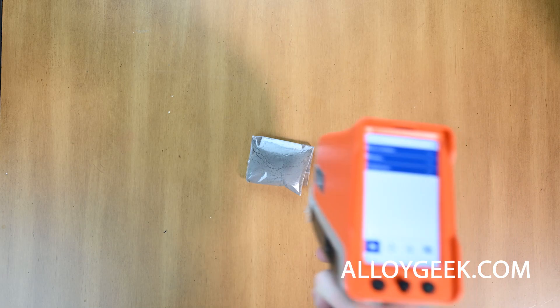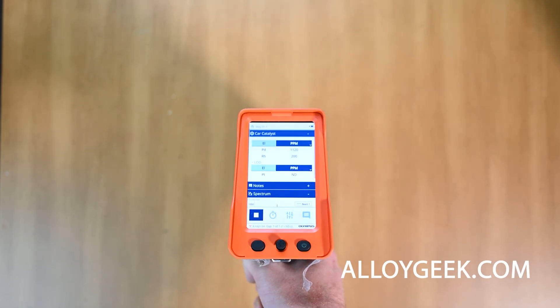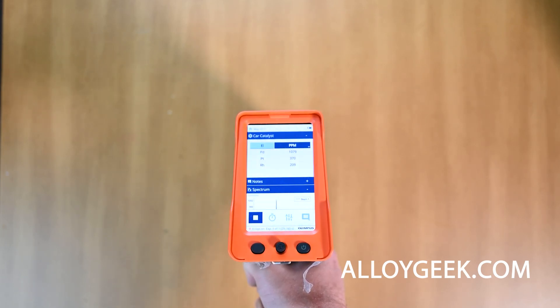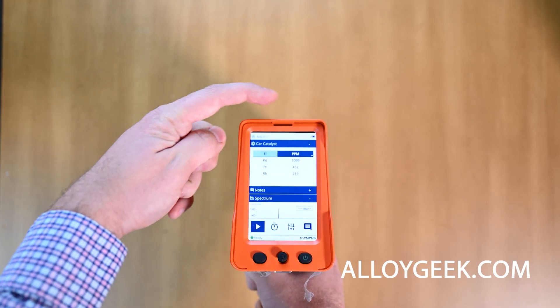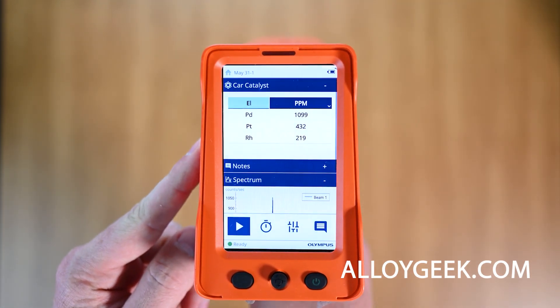Now we can begin the test. I've sped up this test because each test should take at least one minute long. The longer you test, the more precise your results. Once the lights have stopped flashing, as shown here, your results are ready, and you can take a look at the results of your analyzer.